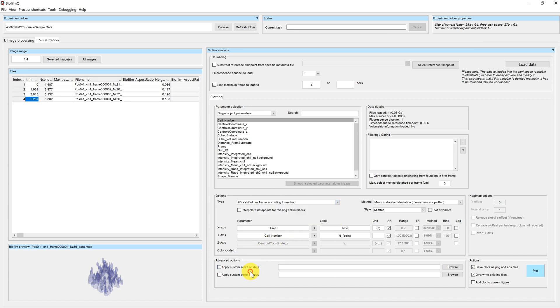The advanced options enable you to apply a custom script on your data before plotting or on your plot after plotting. They will be discussed in an additional tutorial as well.